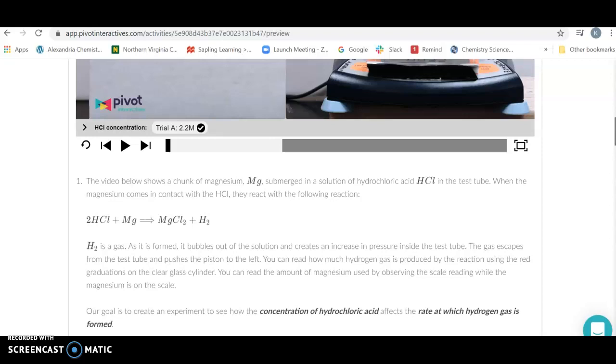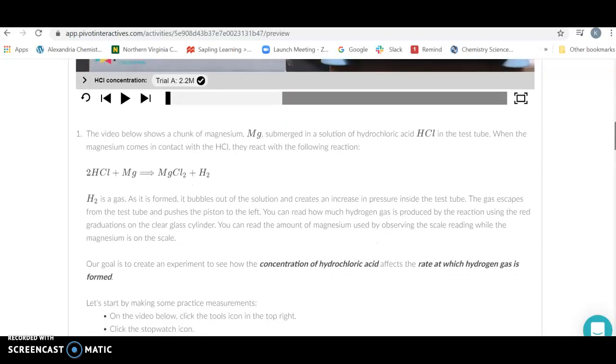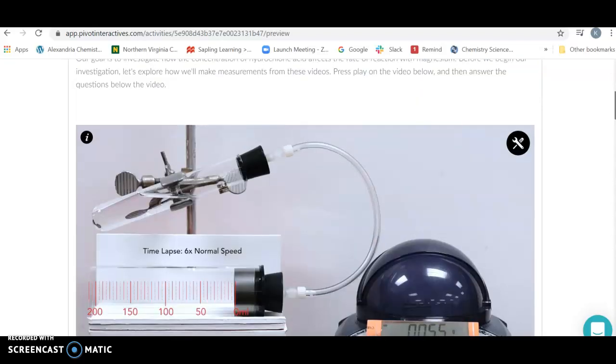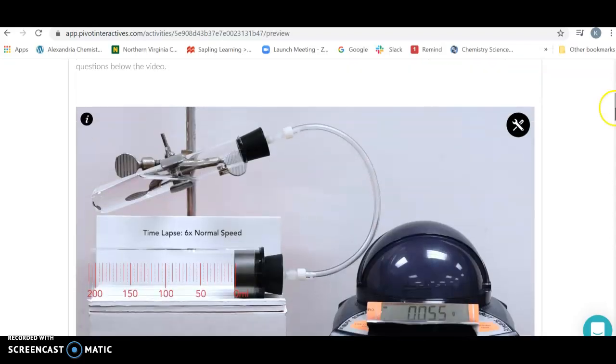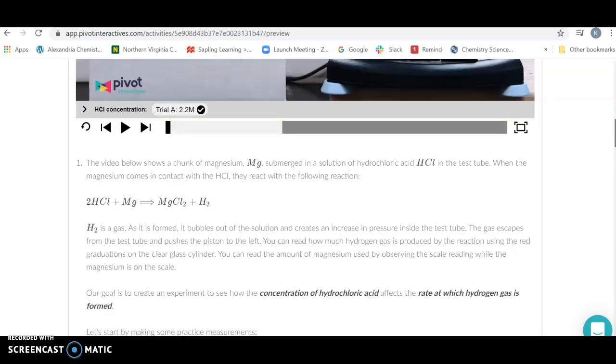The reaction: 2HCl reacts with magnesium to make magnesium chloride and hydrogen. Hydrogen is a gas and it's going to come bubbling out into this little syringe. We're going to measure how long it takes to make 15 milliliters of hydrogen gas and see if that time, the rate, depends on the concentration of the HCl.